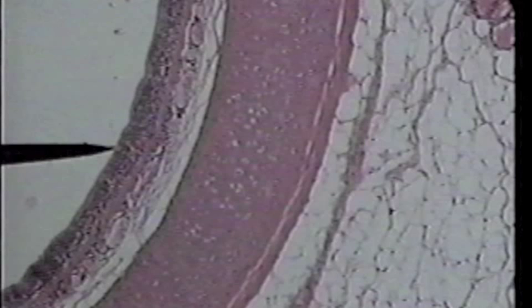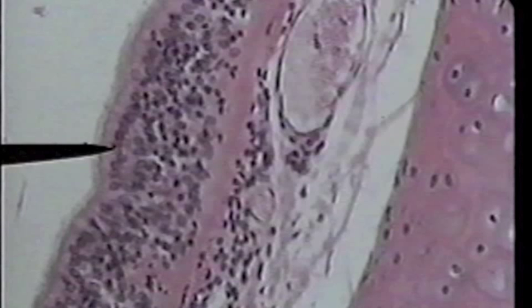We will now move to the same slide on high power so that we'll be able to see. We are now looking at the trachea on high power. The lumen is to the left, the clear area.